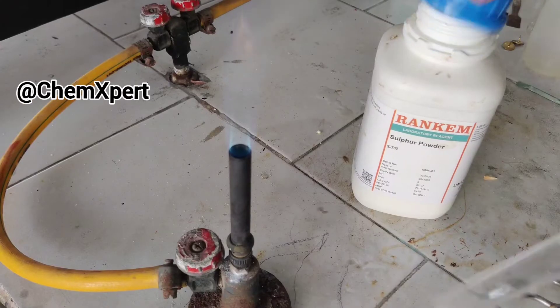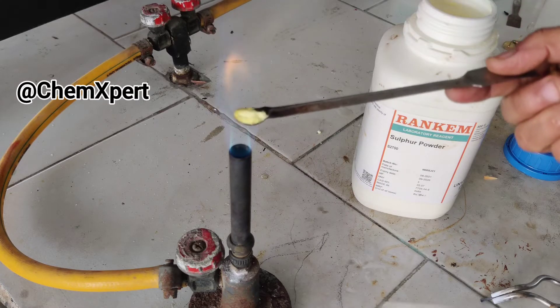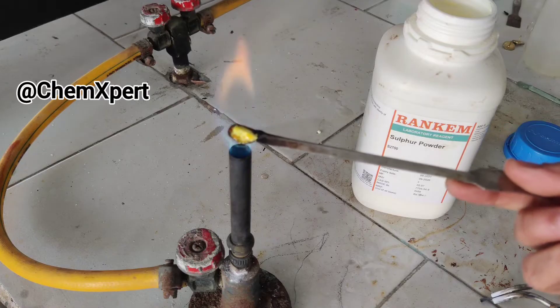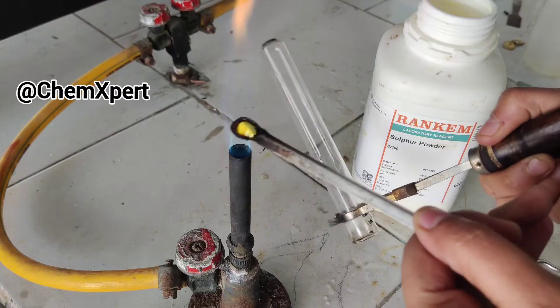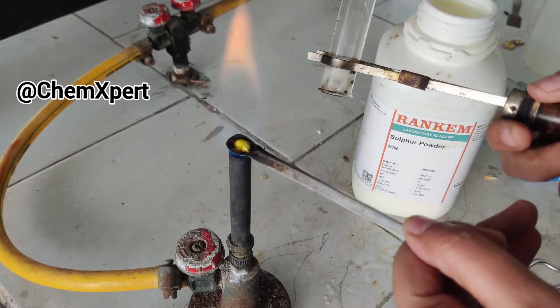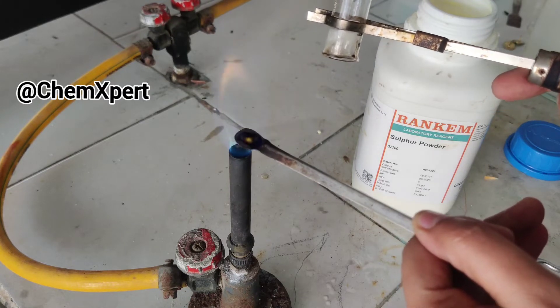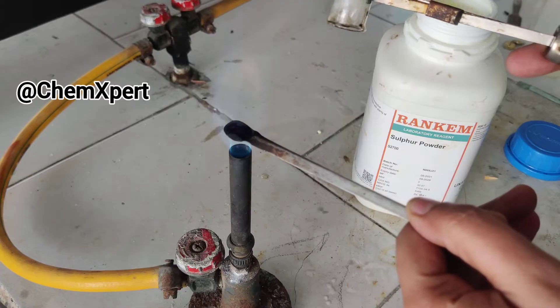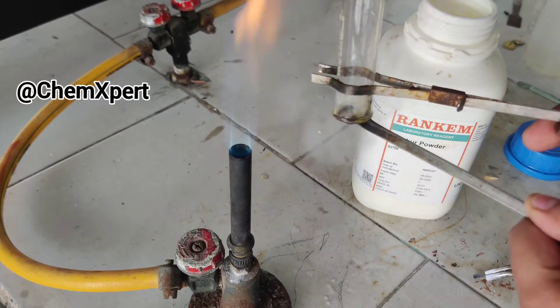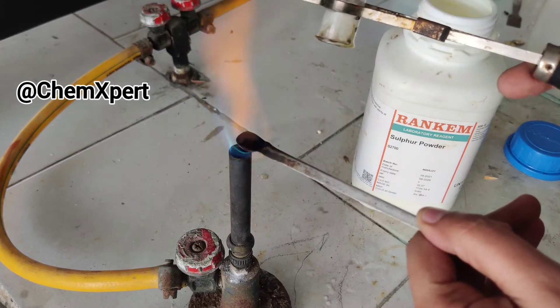Now for the second part of the activity, we take sulphur powder and heat it over the flame, then collect the fumes in an inverted test tube. I have taken the test tube just like this. I am heating the sulphur over the flame and you can observe fumes are obtained which I am collecting in the test tube.